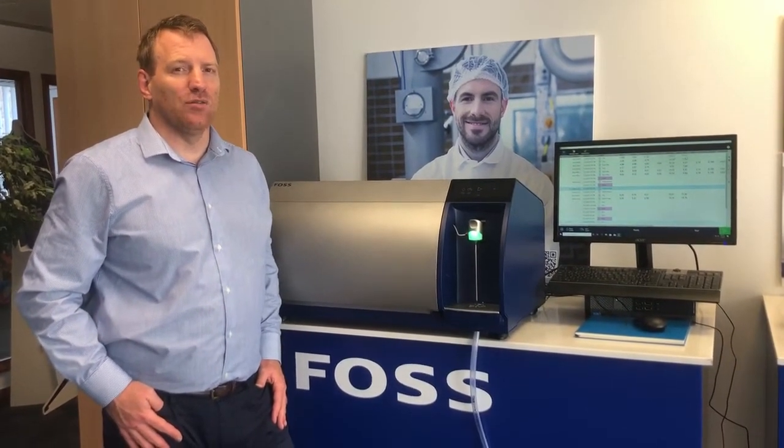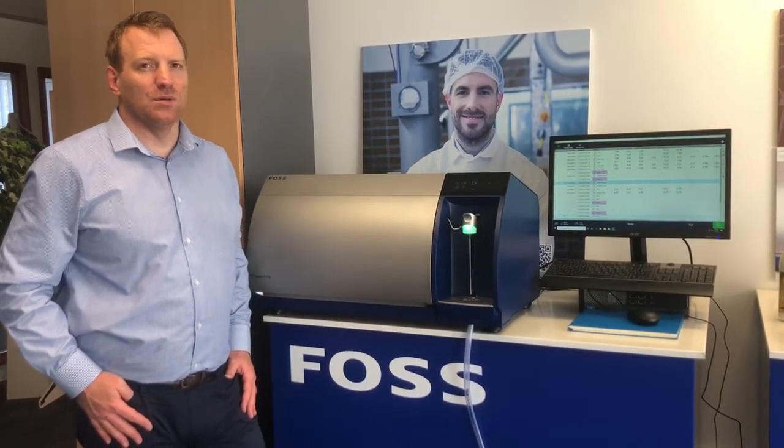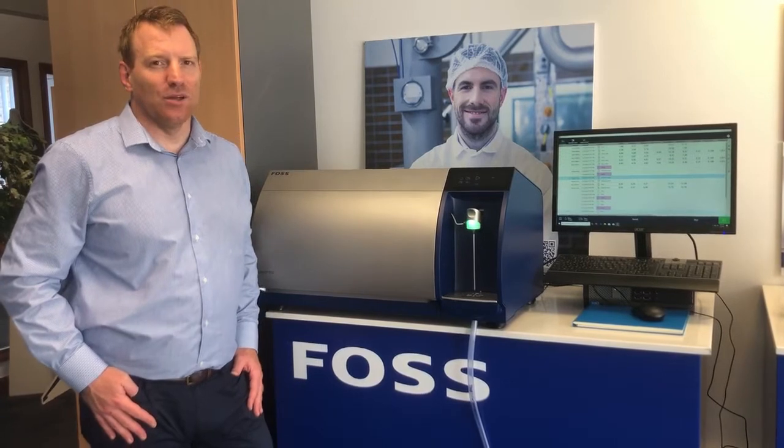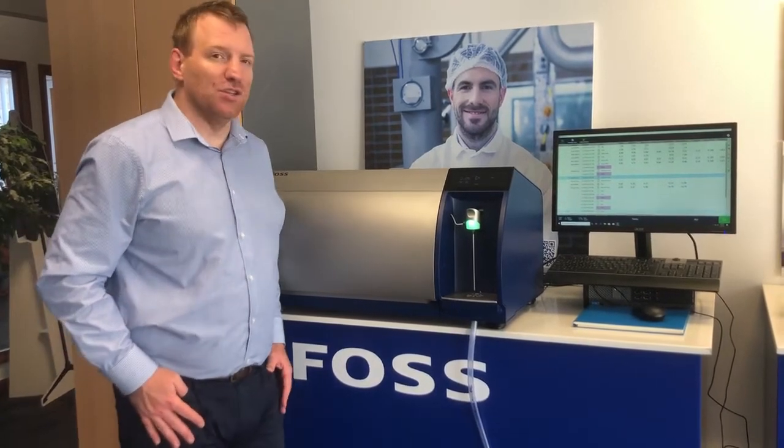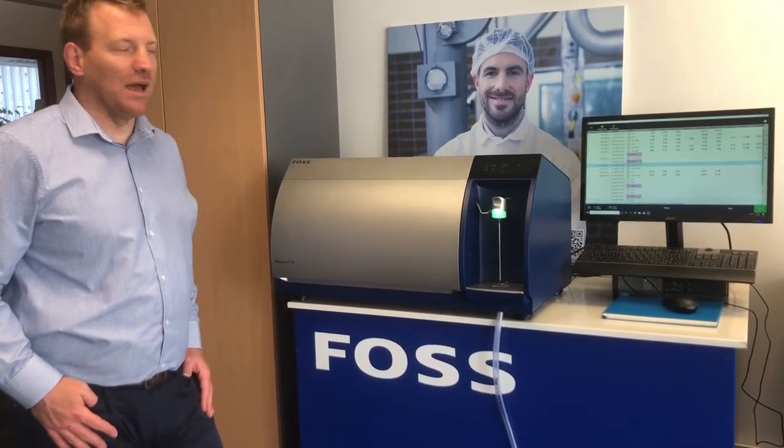Here today to take a look at the FOSS MilkaScan FT3 — the all-new MilkaScan with brand new technology. There are lots of new features and benefits to talk about, and we'll quickly show you through some of them now.